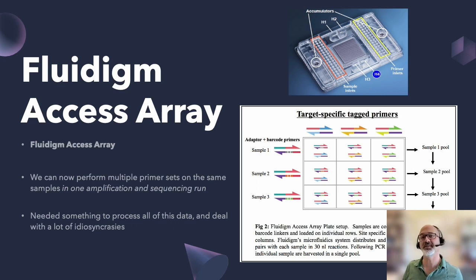And we've had studies that have looked at 16S, ITS, 18S, Archaea specific primers, as well as pathway specific primers. So up to at least 20 to 30 different amplicon or primer pairs can be run. So this can generate a tremendous amount of data. And so we want to have a workflow that can adapt to these various idiosyncrasies with primer pairs.